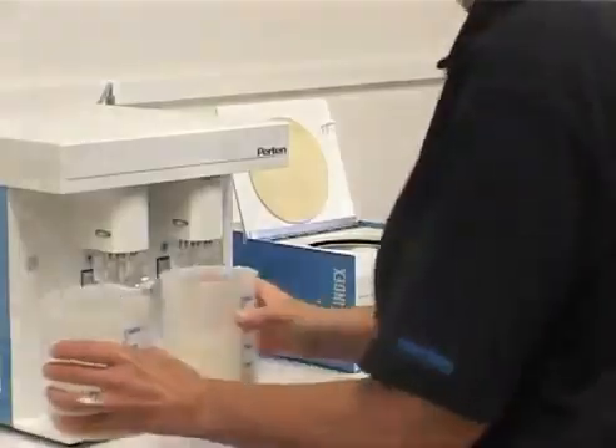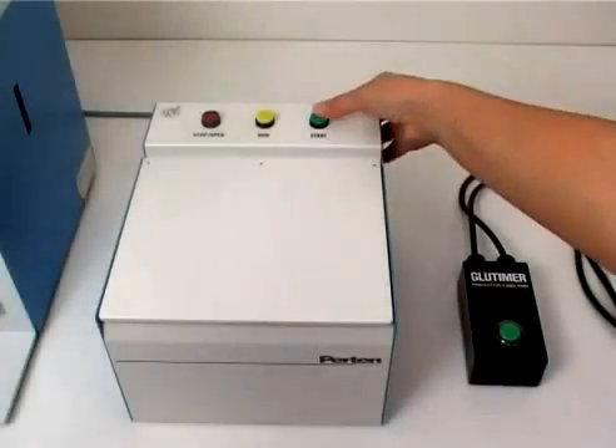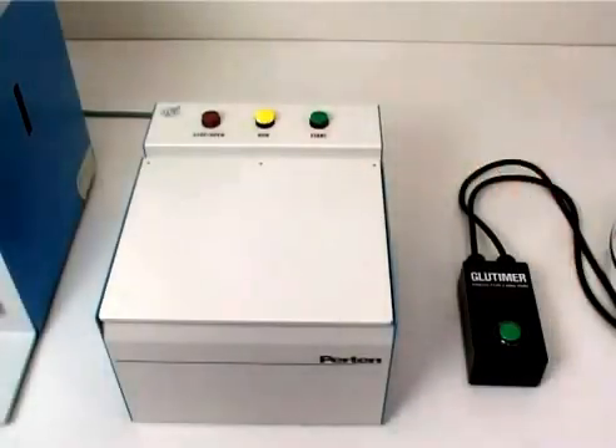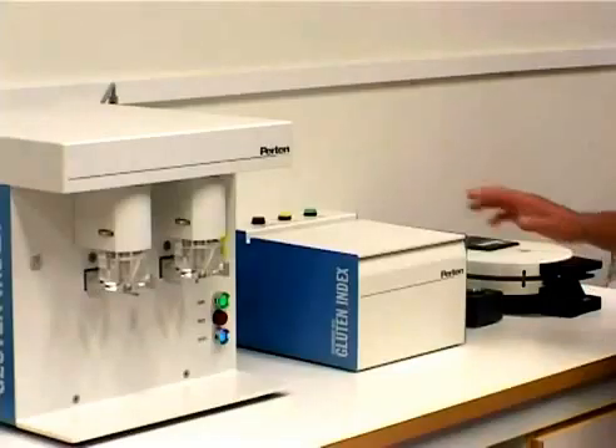When the washing stops, remove the wash chamber. After 60 seconds the centrifuge stops and signals the completion of this step.